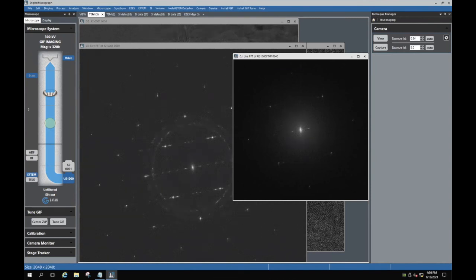Okay, that's great. Dave has quite a few students that are pushing this, and there are a few new professors and new projects, so we're going to start using the K2 much more. I'm very interested in, and I think some people are already moving in that direction, doing some atomic EELS on MOF. I think it's possible, and there are some labs in the world already moving in that direction, trying to do atomic EELS on MOF to see the position of different metals. We're going to try to do the same. I think that would be really impressive. With my limited exposure to MOFs and seeing how beam sensitive they are, that would be a huge success.